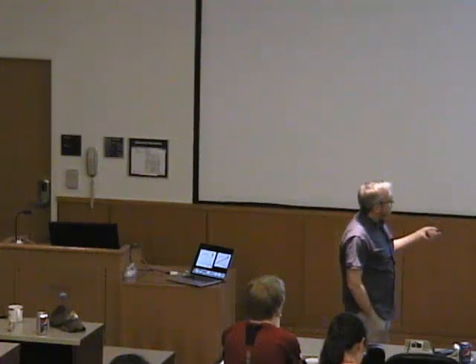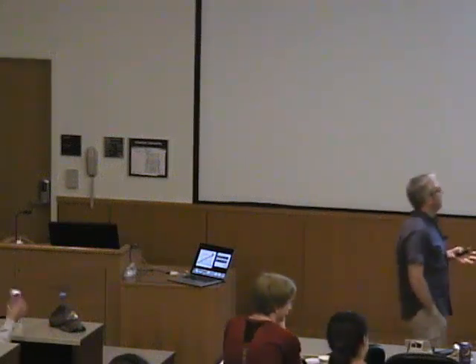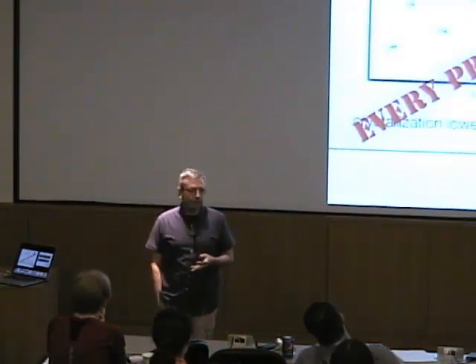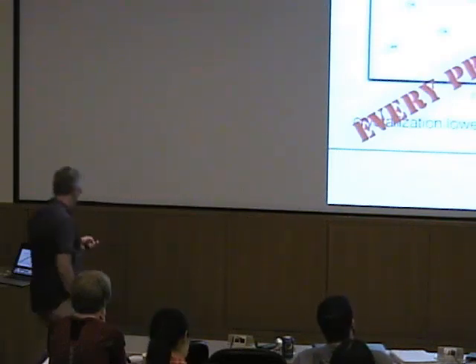And then the whole process becomes energetically favorable and crystals grow. So the message is, at that point, every protein wants to crystallize. Okay? Not every protein knows that. Might take some convincing, but it's not an exception, and it's not a miracle if these things crystallize. It's just thermodynamics. Okay? And we all like thermodynamics.